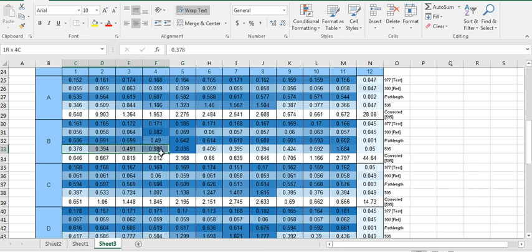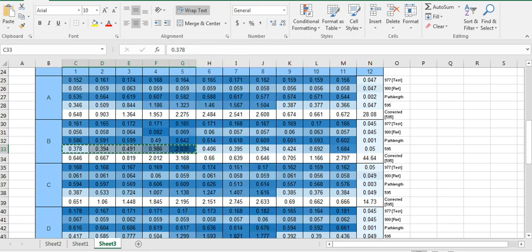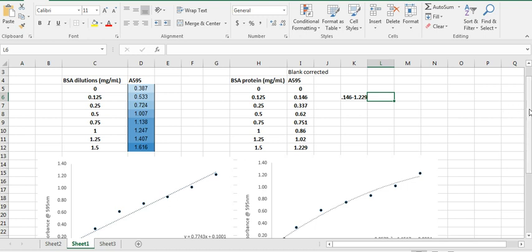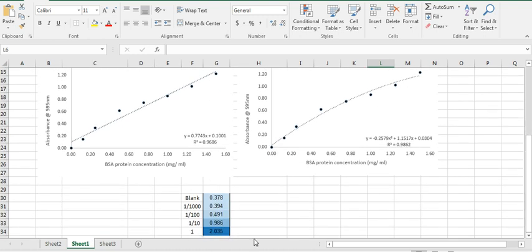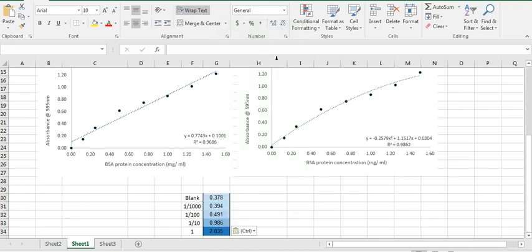I'm going to go ahead and copy the information, all the dilutions and absorbance for one of these samples over here by going to Control V and copy it. I will then place it in my actual chart where I'm going to be doing my calculations. So I've already done that over here, but basically you will go to where you need to paste it, and again I transposed them so that instead of being horizontal they were now vertical. I also placed in the dilution factors for these unknown proteins.